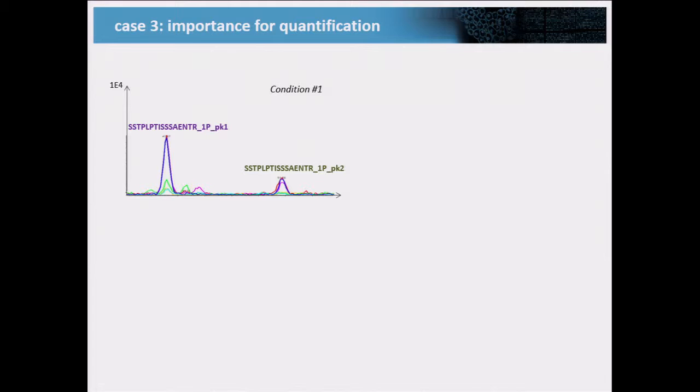Of course, here we have the problem that we only have information that these two are separated in retention time. We're still not sure about site assignment. So what can we do now?